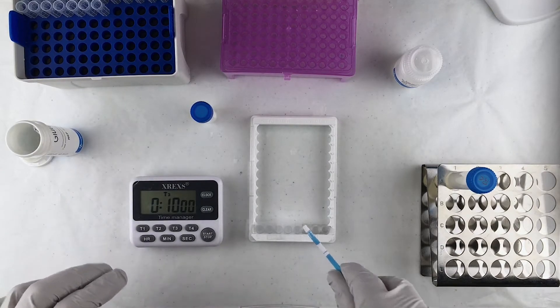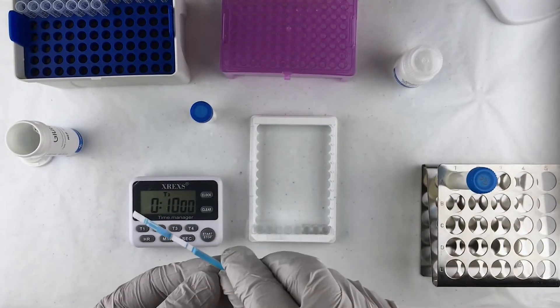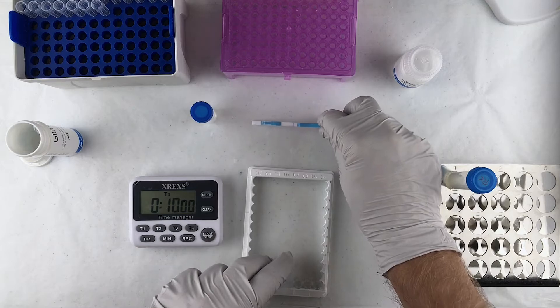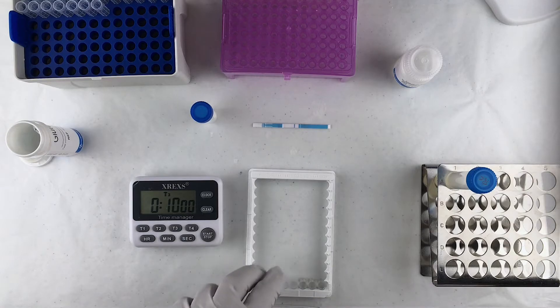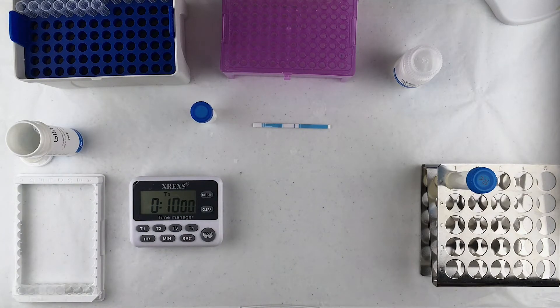All right, let's have a look at this test strip. And it would appear that according to GlutenTox Stix Plus, General Mills Rice Chex is gluten-free at a limit of detection of three parts per million. In other words, if this product contains any gluten, it is below three parts per million. So that concludes this test on General Mills Rice Chex using GlutenTox Stix Plus at a limit of detection of three parts per million.